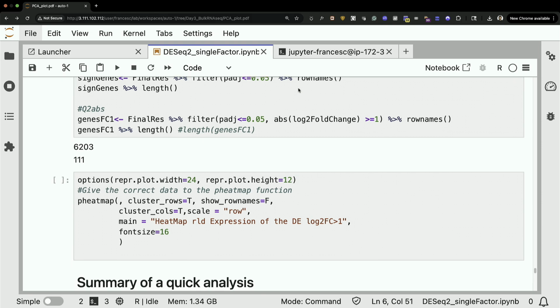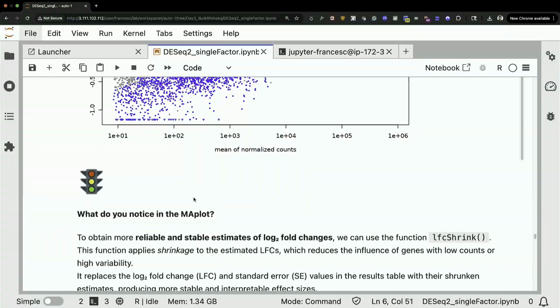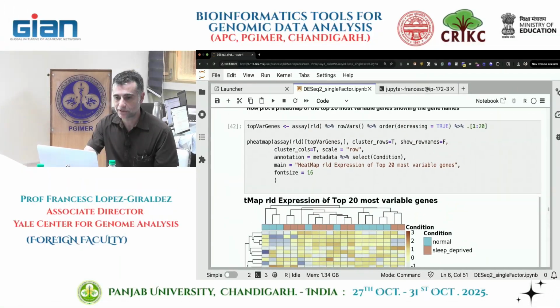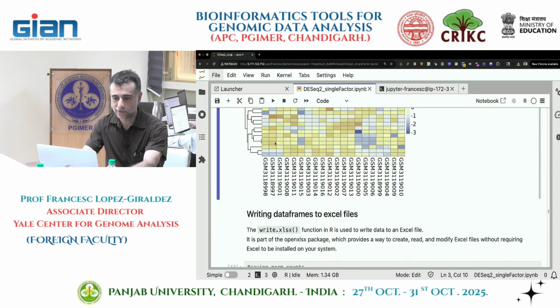So how is the heat map? No? Okay, good job. I copied Bhumi's. So again, I'm not saying anything new. We already plotted a heat map, right? What is it? The easiest thing. I'm giving you tricks how to answer the question. So this is the information we need, right? But instead of the top variable genes, we need to provide. So you can even come here, copy this.